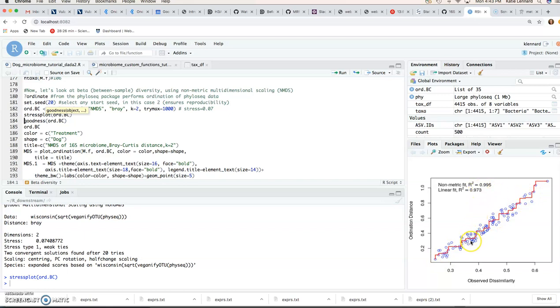So if you see something that's radically off of this pattern, then you know maybe it's not the best representation of your input matrix of pairwise distances.